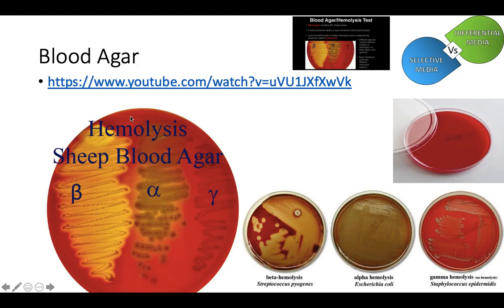This is a type of nutrient agar plus blood, and the blood gives the fastidious organisms what they need to grow as well, which is why this is used for strep. It's a fastidious bacteria. It is not selective. Pretty much everything will grow on this. But it is, however, differential. What does grow on it, if you know what you're looking at and you've done your diagnostics correctly, you will be able to tell apart what you're looking at.